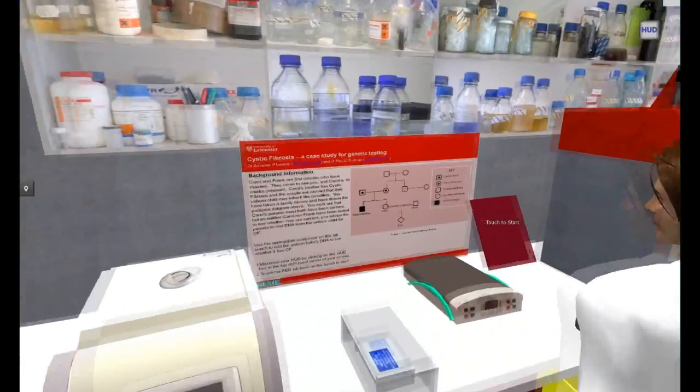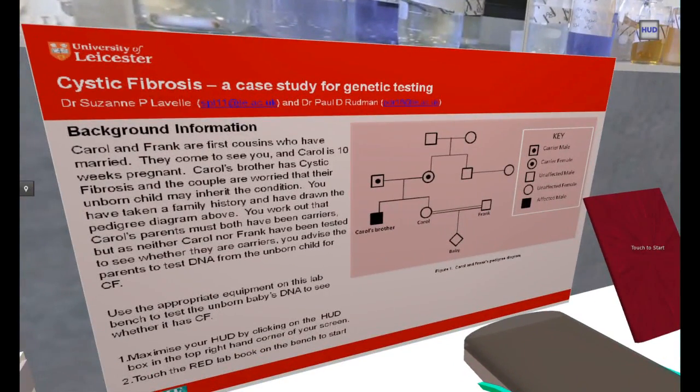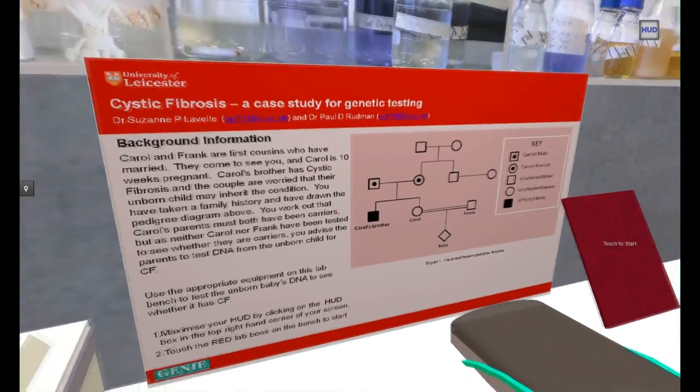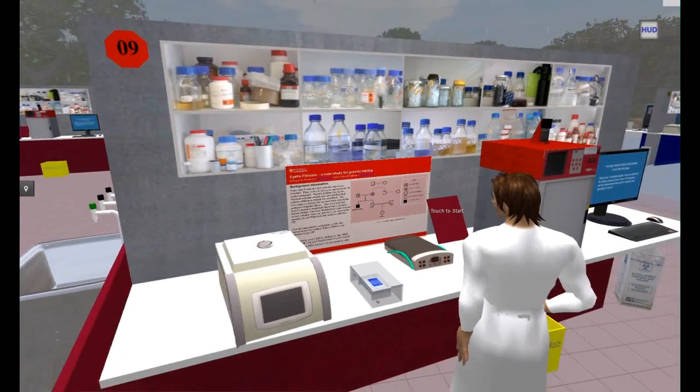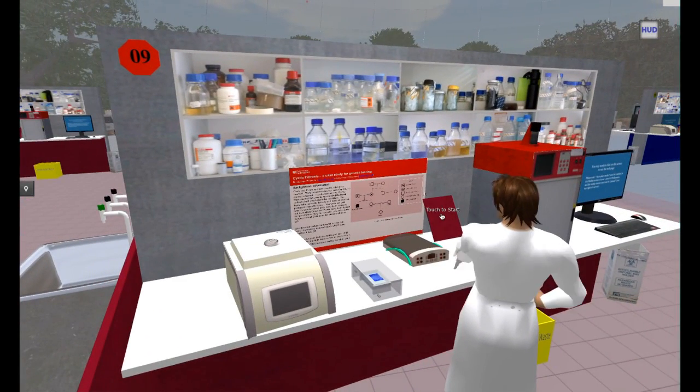In this virtual world, they don't need to learn exactly how to do the tests, just to understand how the different procedures fit together and how they connect with the theory.